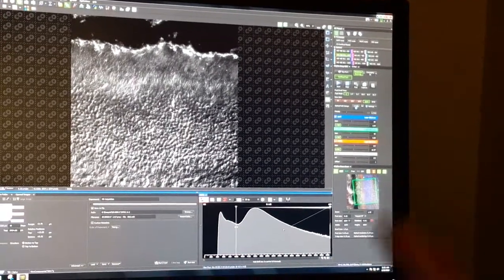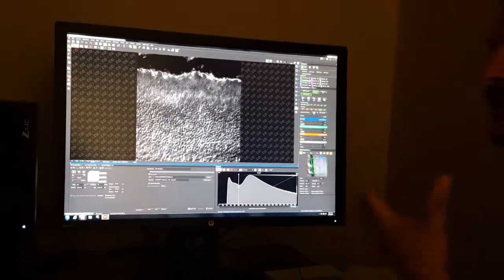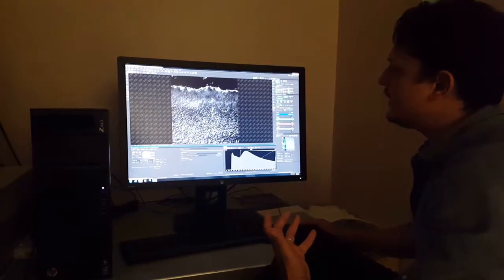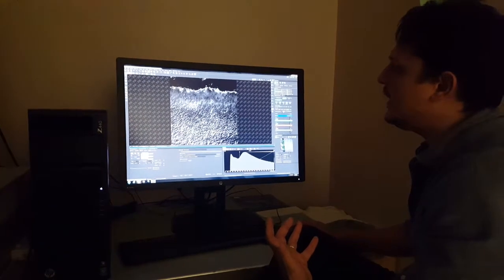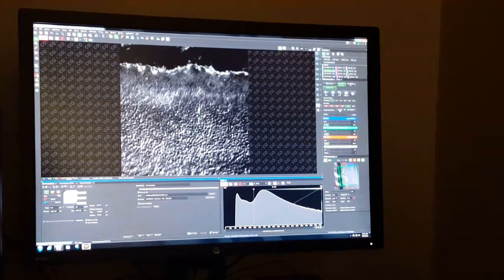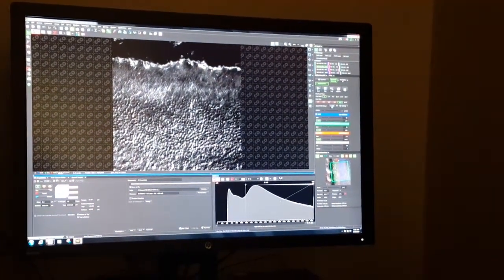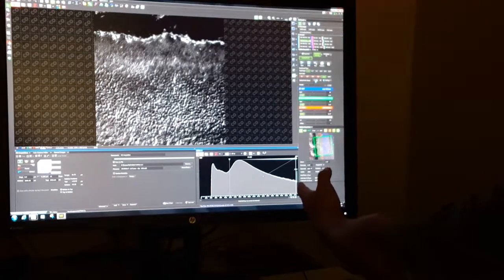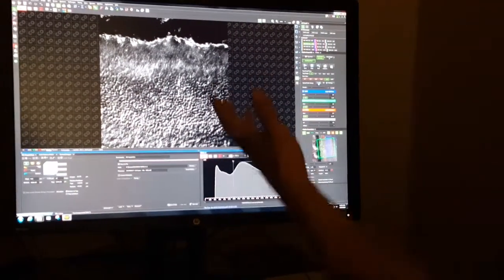In DIC, I used to go darker because otherwise it's going to mask the other colors. So I can go here and I can distinguish the inner segment from the outer segment, and the RPE microvilli in fact, and the RPE, and here are the nuclei. You can go down and up.